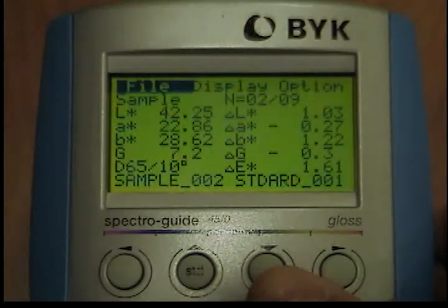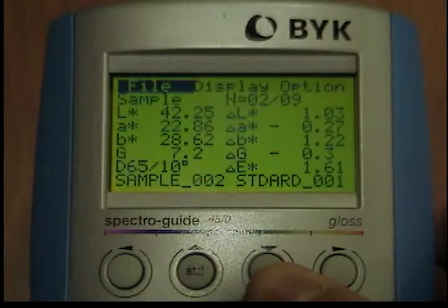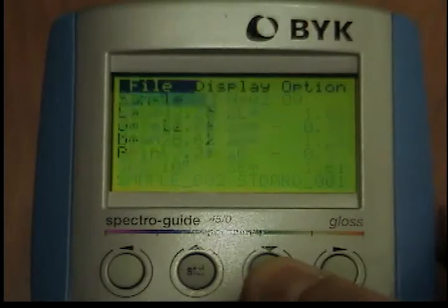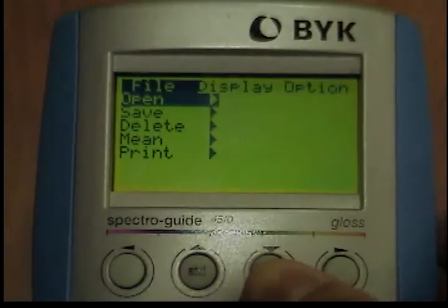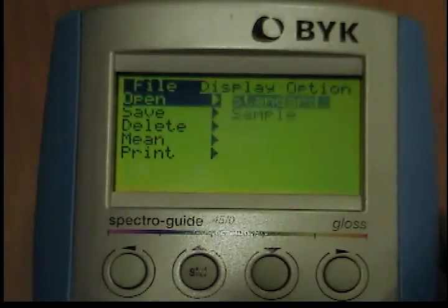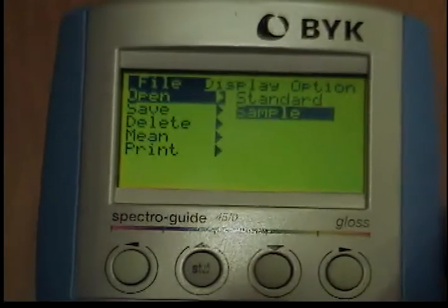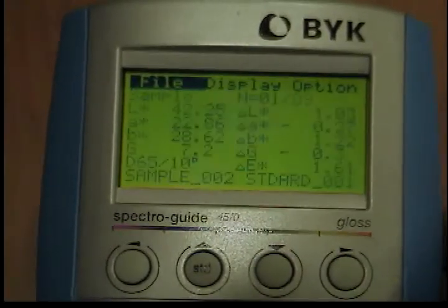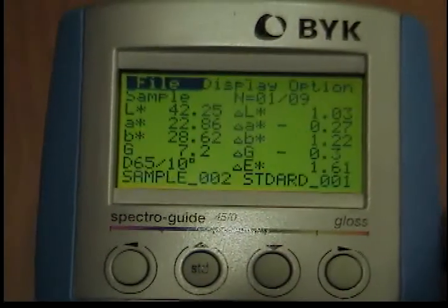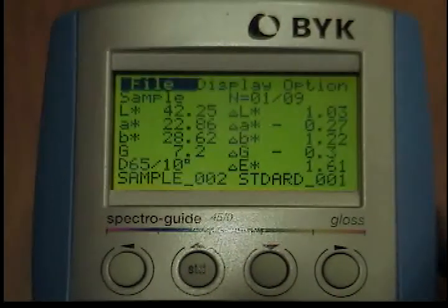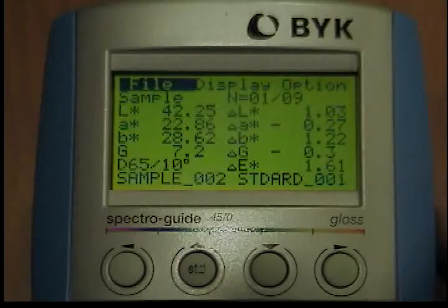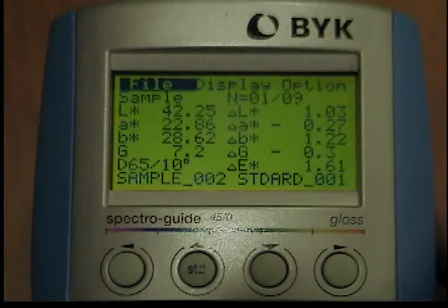The procedure for opening a sample is identical. Instead of Standard, select Sample with the cursor. The rest of the procedure is identical to the selection of the standard. When you press the Operate button, the instrument will return to the previous measuring mode. The selected sample will be displayed at the lower left.